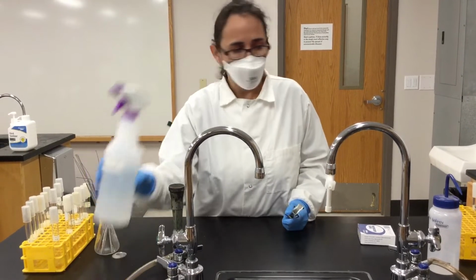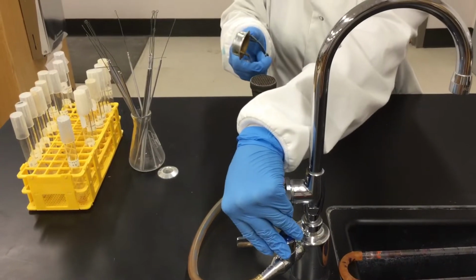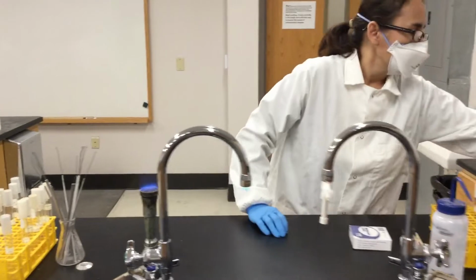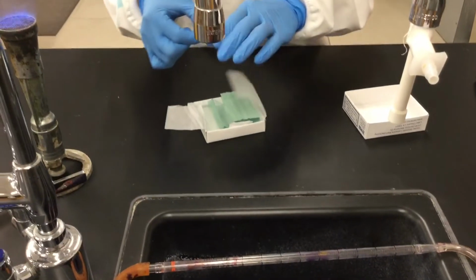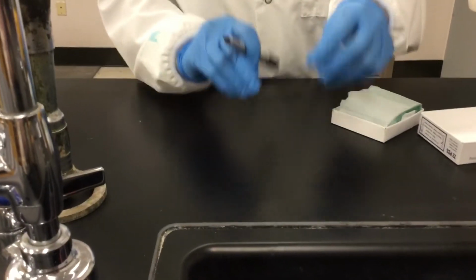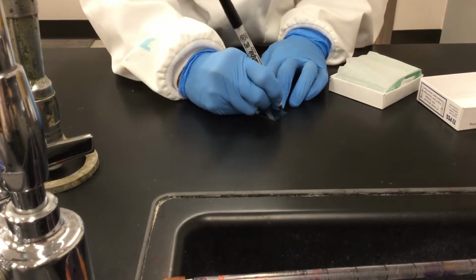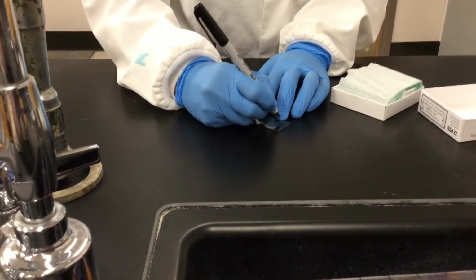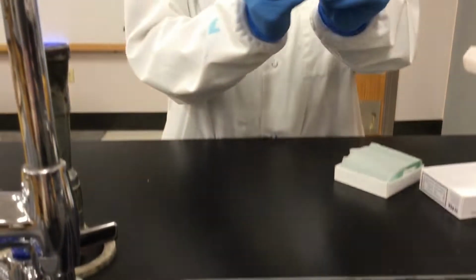So, in order to turn on your Bunsen burner, you open up the gas valve, and then you can hear the gas coming out, and then you just strike your sparker there. You will have to take your glass slides by the edge, and they're supposed to be clean, and you will label them appropriately. You use this frosted part at the top to label whatever bacteria you are putting there. In this case it's Micrococcus luteus. So I'm going to put a capital M and then luteus with lowercase, and then today's date, and then your initials. So that's what you will do.